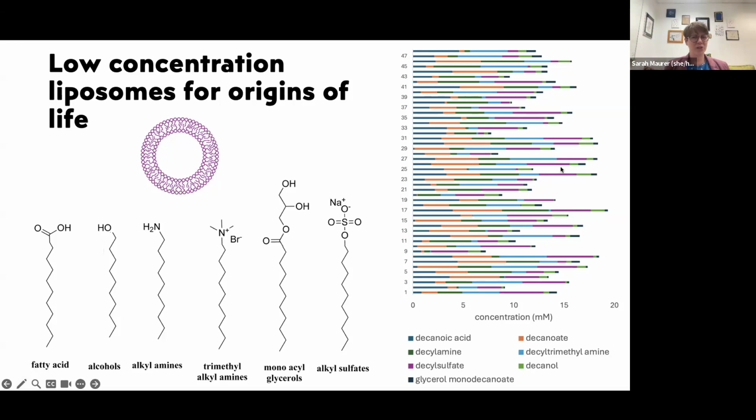We are not trying to control size distribution, although I can see from a cell biology point of view, you might want to do that. If we are thinking about function, there may be a way to control size distribution by having a fairly impermeable membrane, and then using some kind of osmotic force to make sure that they're stable over time. But that's definitely a future plan.